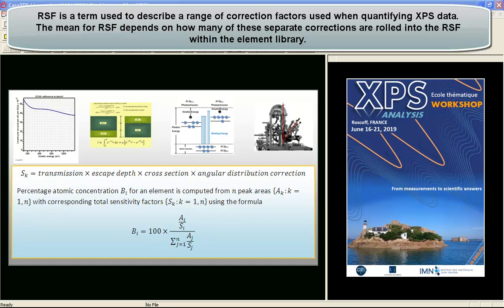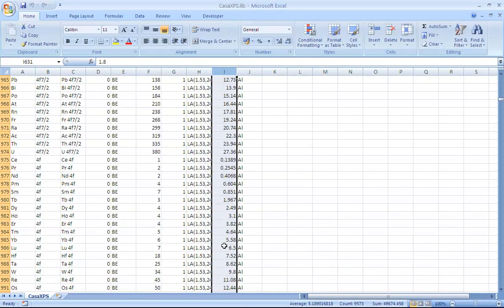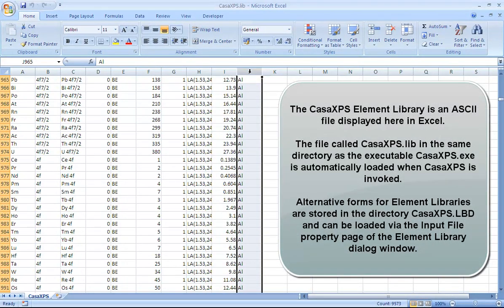These depend on the X-ray anode material, so aluminum or magnesium. We also need to allow for the fact that different instruments may tabulate different forms for sensitivity factors. The way this is performed in CASA XPS is to produce an element library that includes information about the anode and the sensitivity factors that go along with the anode.